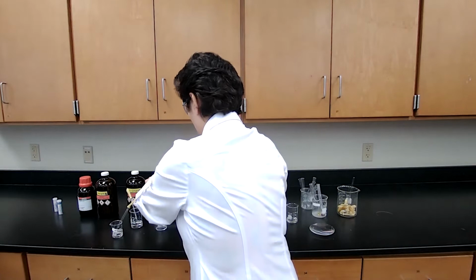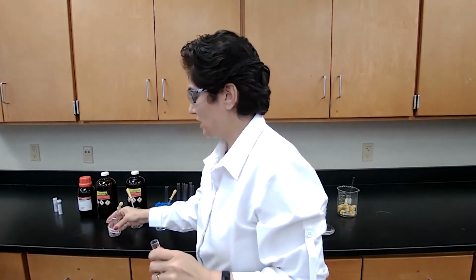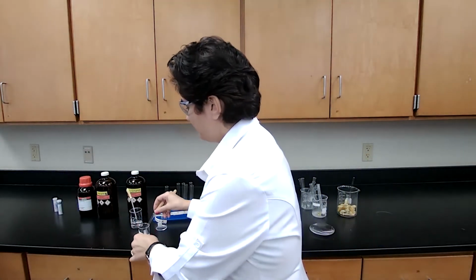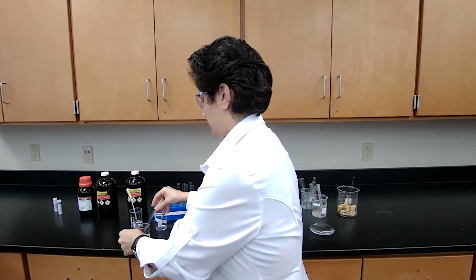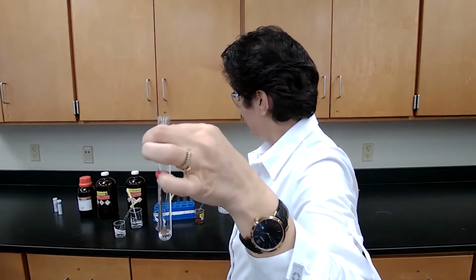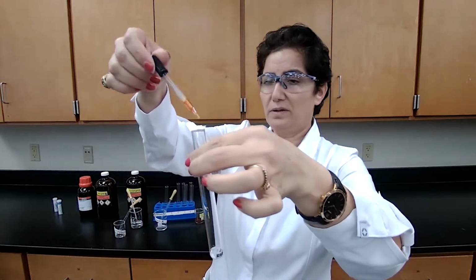And the next compound, our next unknown, is unknown B. I will add it to the test tube. I have the unknown B, and I will add bromine water.